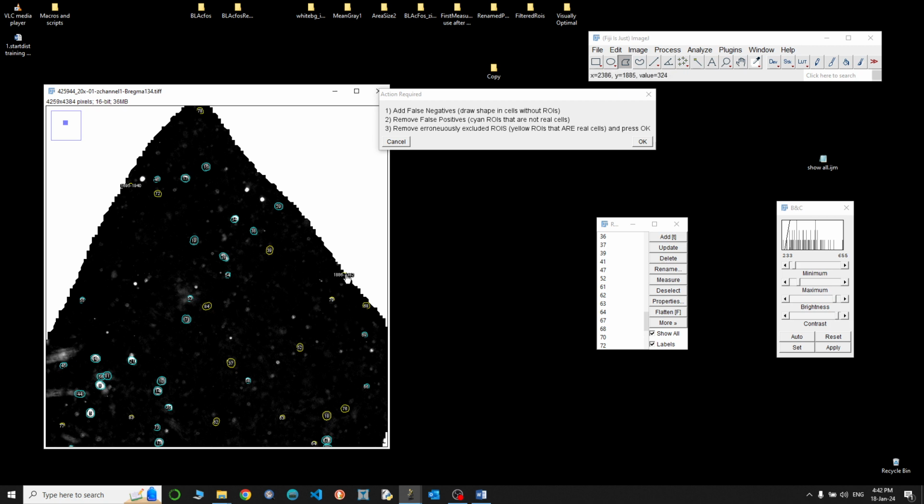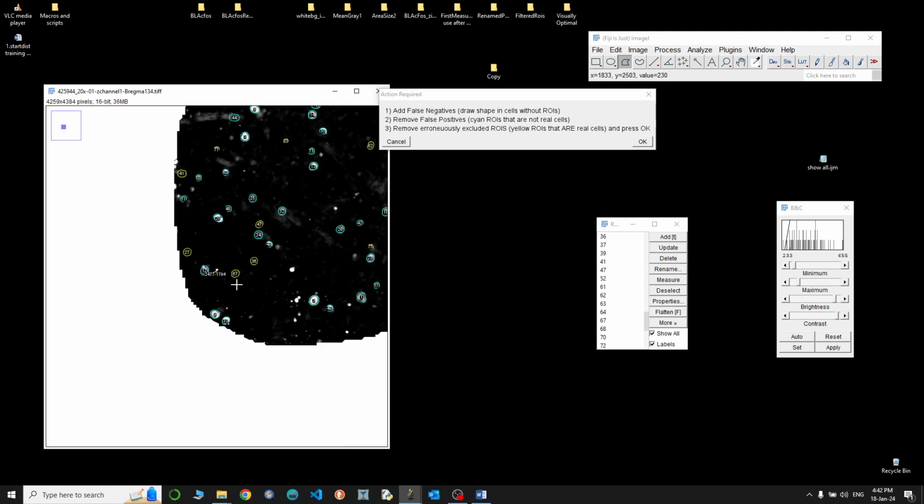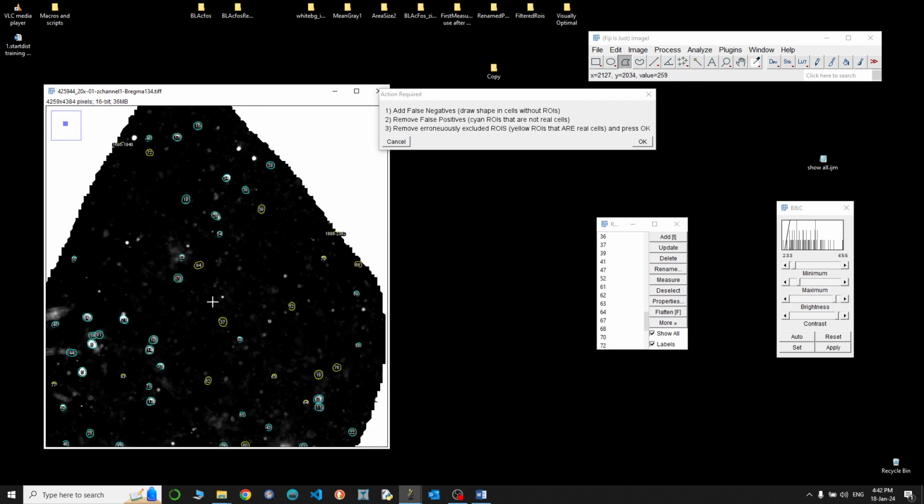All right. So remember what we have added? We have added this one here, and we have added that one down there. I suspect that I excluded one of the blue ones. If I didn't, I should have done that already, but I suspect I excluded one.